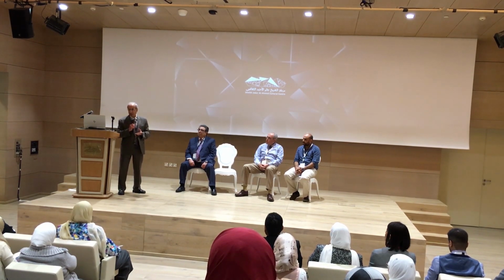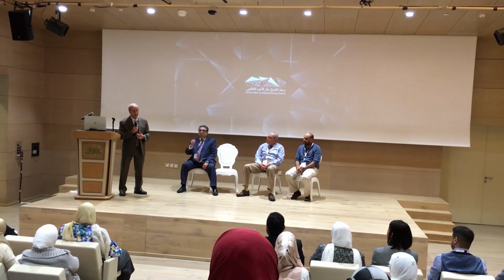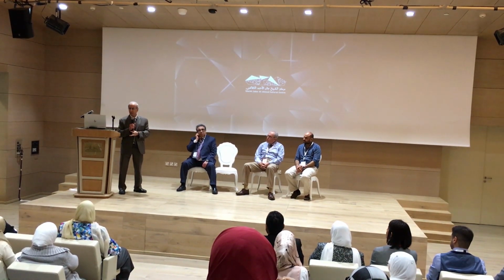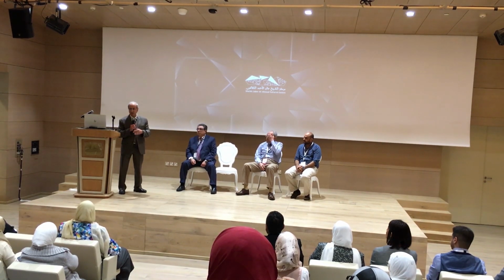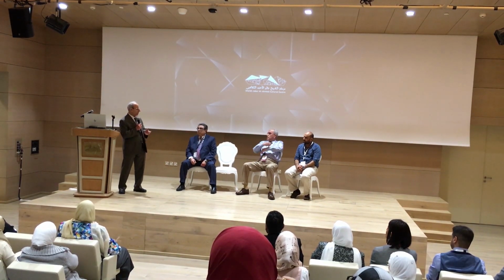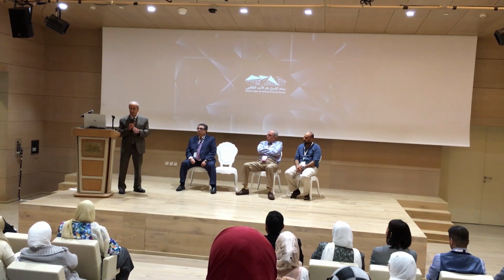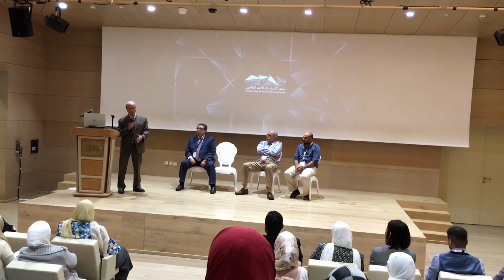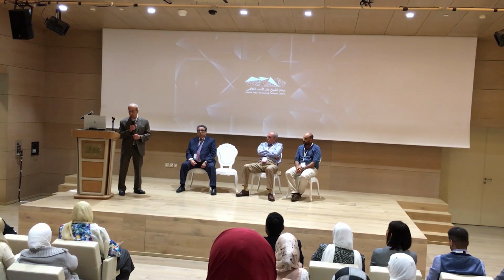Part of the inspection, as you heard from our talks, is to look at the laboratory as a key element of the organization. You are not isolated, or at least we don't like to see the lab isolated from the rest of the hospital. So although we are coming to inspect the lab, we are interested in looking at the hospital too. We're interested in knowing the relationship between the lab and management of the hospital and medical staff.